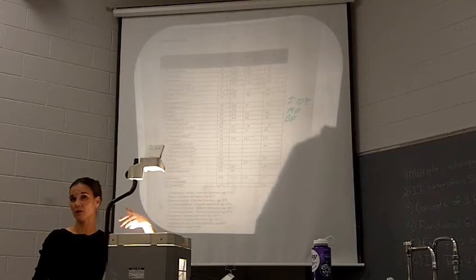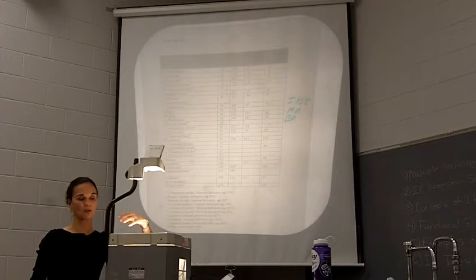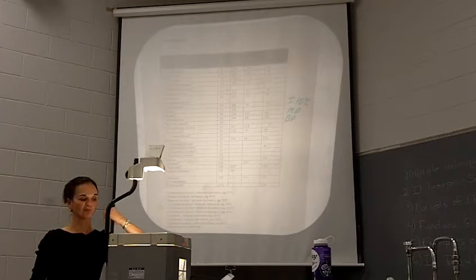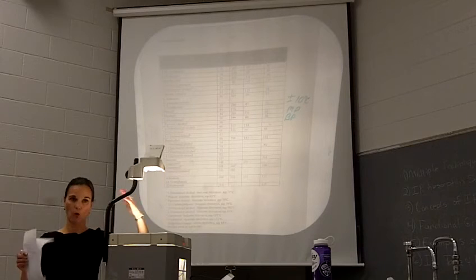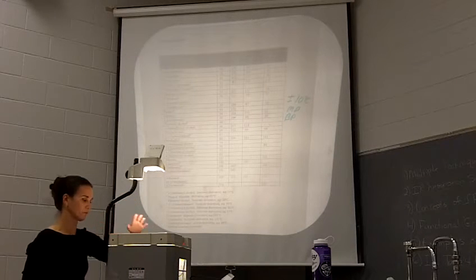And so in a little bit here, we'll talk about what is considered a match, and I'll show you examples of what matches and what doesn't for things that you're looking for in terms of IR spectra, okay? But when we're talking about a match, you do want it to match, and it will match, the whole spectrum will end up matching, okay?